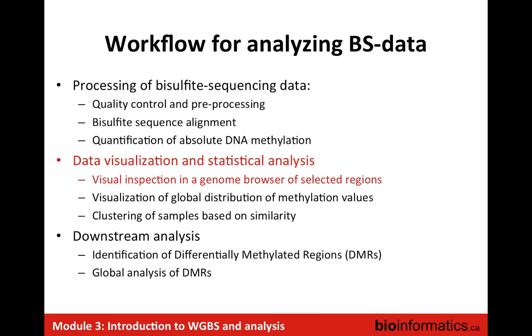Okay, unless there are other questions, I'll move on to the next parts, and maybe we'll finish a bit earlier for the coffee break so that we have more time for the lab. So we've done, as best as we could, the alignment step and the quantification of the DNA methylation. Now we can really move into the data visualization and some of the statistical analysis.